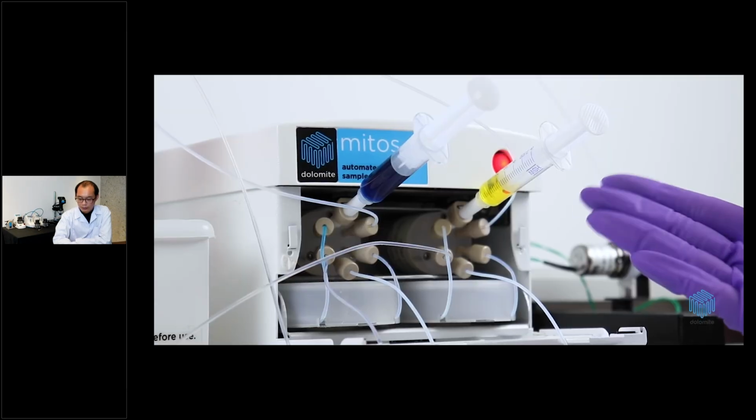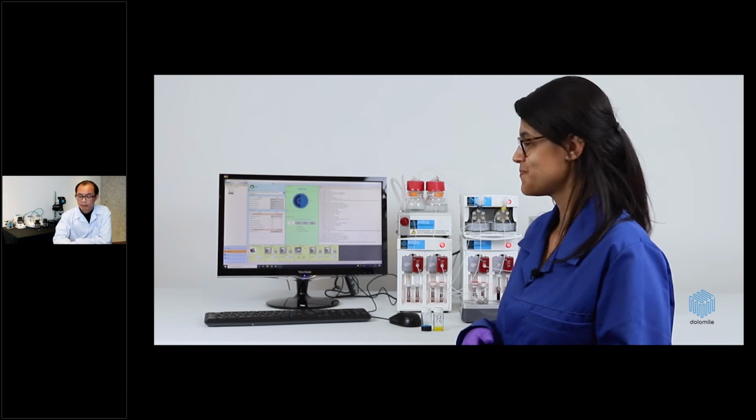We're now ready to load our nanoparticle precursors. As we're running 4 different experiments, you will load the total amount of nanoparticle precursor required for all your experiments. The automated sample valve will gate your repeats in the sample loops, only releasing enough nanoparticle precursor to run 1 repeat at a time. For the purposes of this demo, I'm using 2 different food dyes, yellow and blue, as this will allow you to visualize them as they travel towards the chip. Let's load the samples.